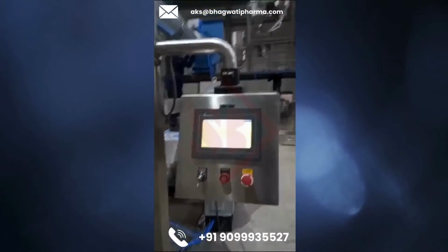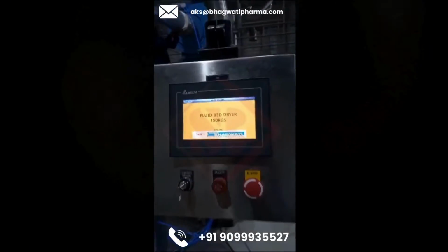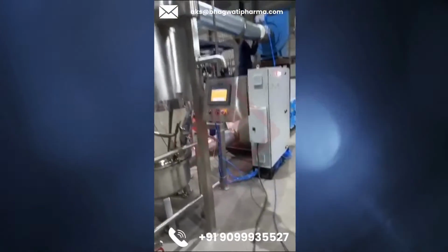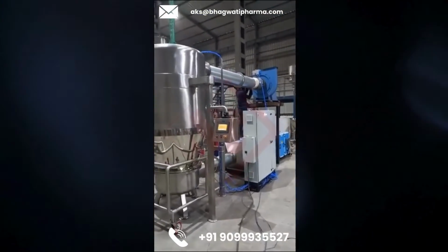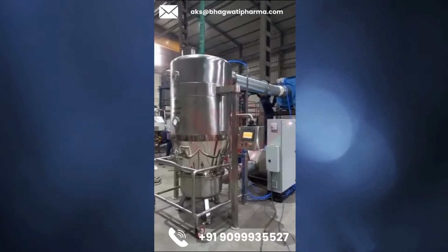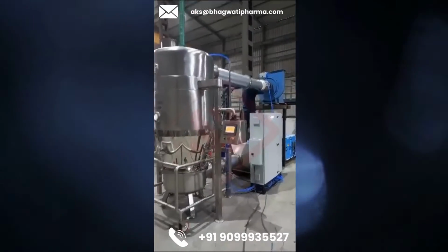Fluidization: the primary principle behind a fluid bed dryer is fluidization. Solid particles are suspended or fluidized by passing heated air or gas through a porous membrane or plate at the base of the drying chamber. This creates a fluid-like state, allowing for efficient mixing and drying of the particles.